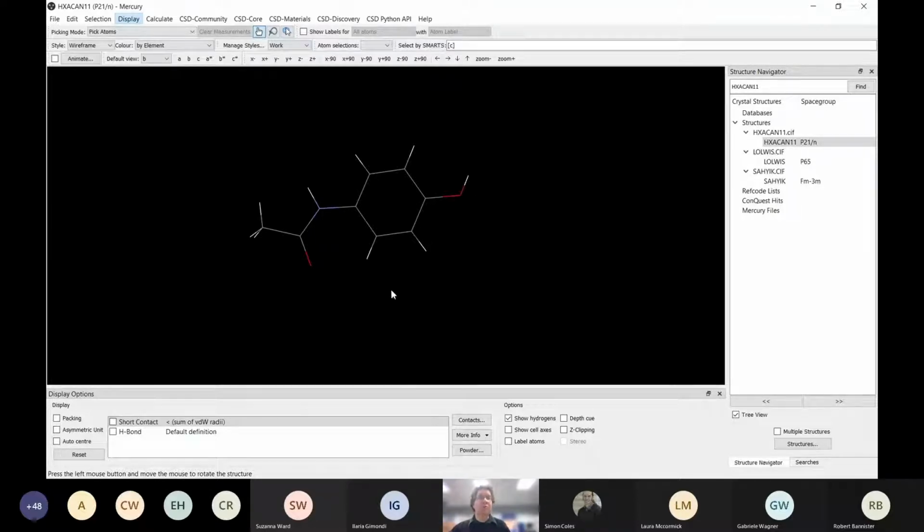You have a lot of options which are very simple to reset. And probably one of the other ones down the bottom is this reset. If everything's gone wrong, you can click this and it will reset back to the starting position you started with, which if you've got problems, can always be a help. So that is a lot of the toolbar options, but we haven't actually done anything on investigating the structure.